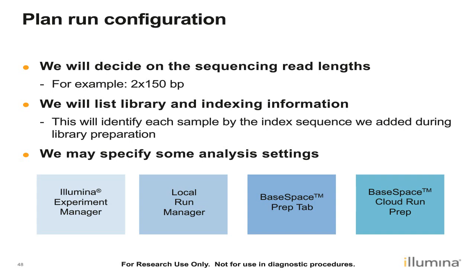Next, we will need to list our library and index information. This will help us to identify all of the samples pooled together according to the index sequences added during library preparation. We may also specify some post-sequencing data analysis options at this stage.